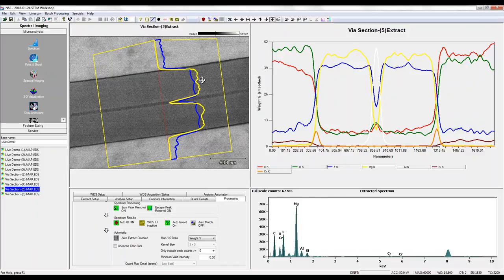But it's very clear that we're able to detect something that's very, very subtle by using all the data available to us in this line scan extract in order to see that very, very subtle change in contrast is corresponding to a change in stoichiometry of that magnesium fluoride layer. This may indicate something they did on purpose, or it could be that when they did the deposition, they stopped it partway through and picked it up again as a two-step process, and then there's some non-uniformity in the deposition when it first initiates. But I was frankly pretty surprised we were able to see such a subtle feature.